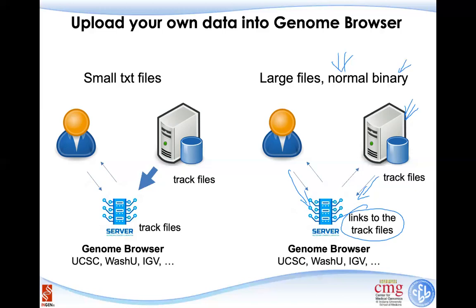That is a short command you send to the UCSC server, and then the server sends the query command to your local computer, which holds an indexed file. Only the part of that file within chromosome 3, between those positions, is sent back to the UCSC server, and then you have the ability to visualize that.